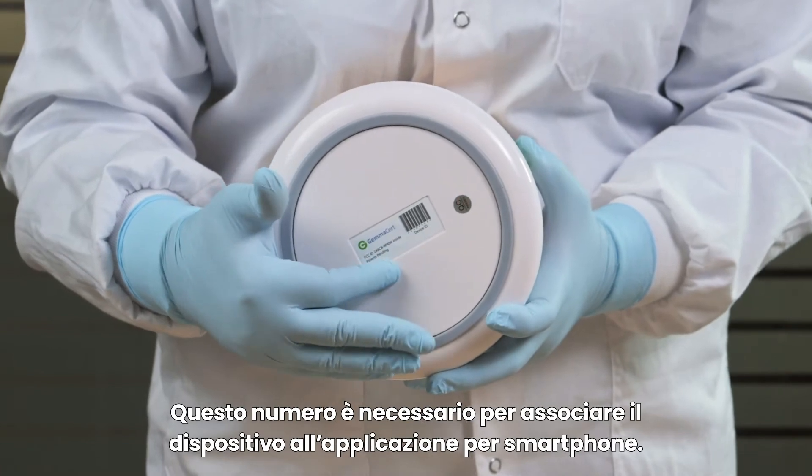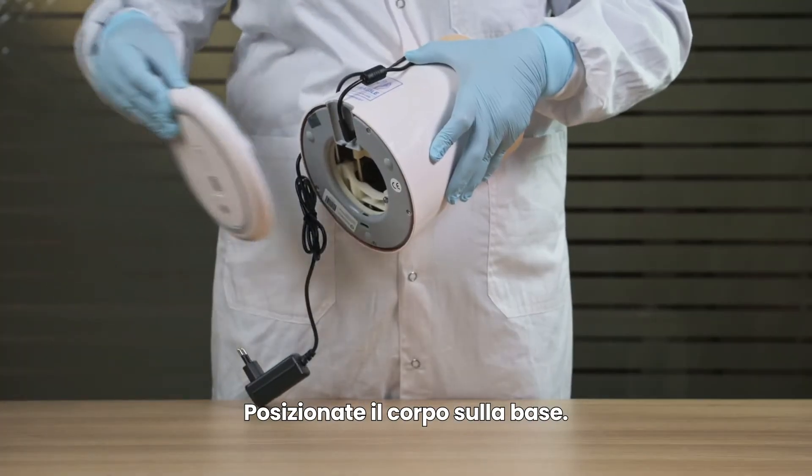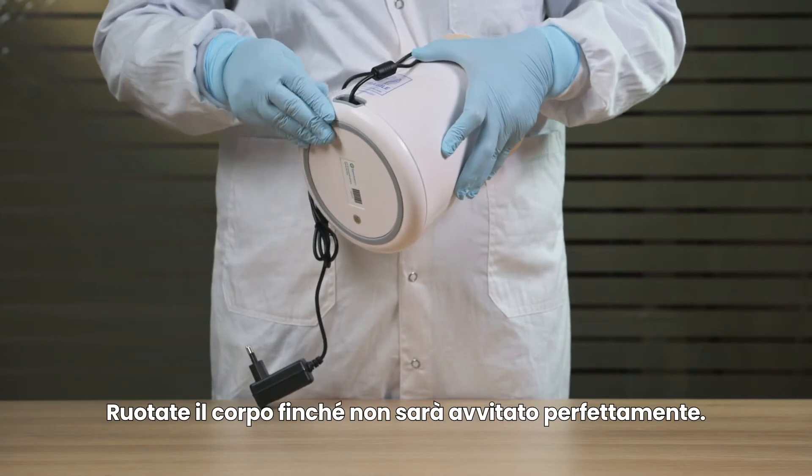You will need this number to pair the device with the smartphone app. Set body on top of base and rotate body till tight fit.